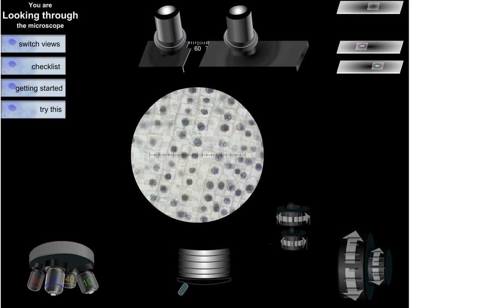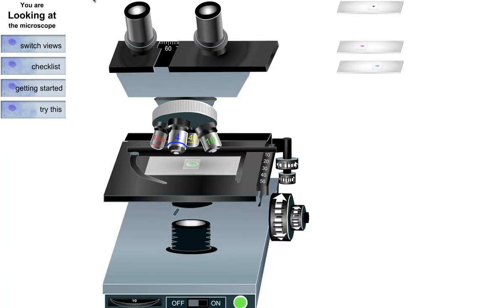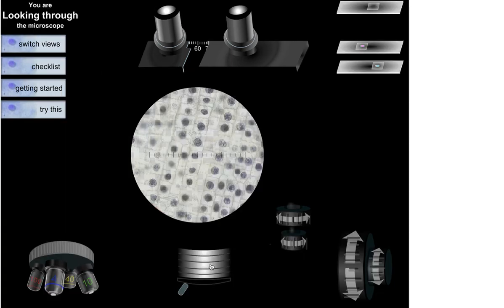Okay, I hope that helps. Let me know if that didn't help. Let me know if you didn't get the animation. You probably need a plug-in. Okay. Yeah, no, it took me a minute too because I did update it a little bit. And again, you want to switch views here when you're just setting up the microscope, and then switch when you want to actually look through the microscope. Okay, great. I hope that worked.